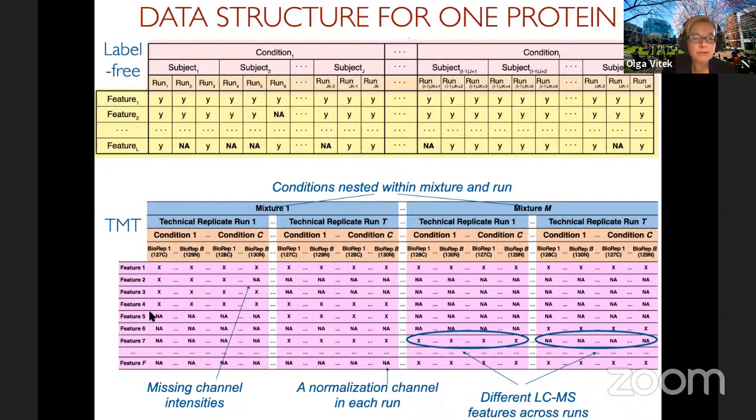But now they are all grouped by the same mass spectrometry run, which can potentially be grouped by the same mixture if these mass spectrometry runs are technical replicates of the same mixture. So they will all have the same biological replicates between the runs if they are from the same mixture.